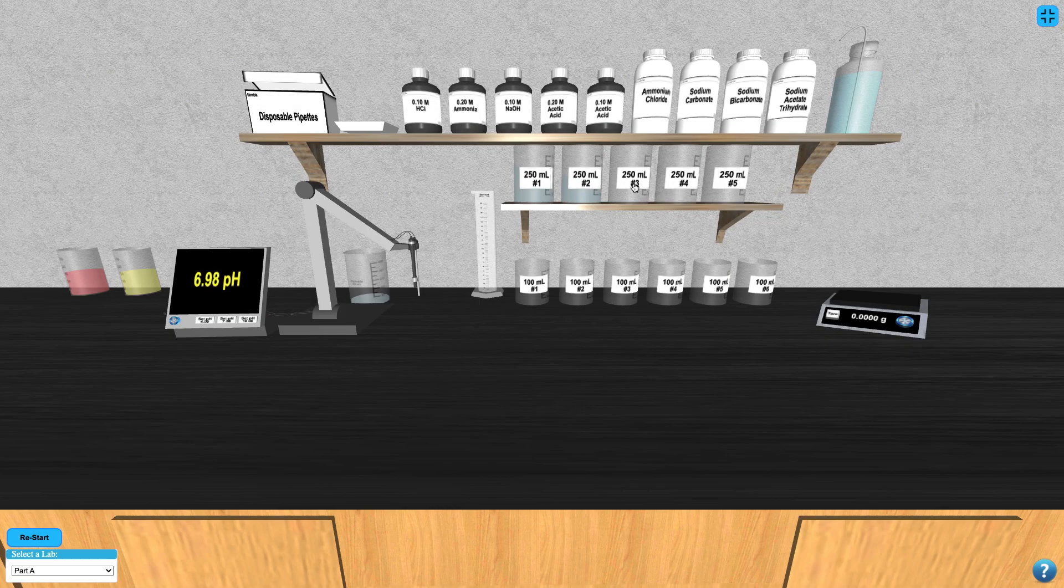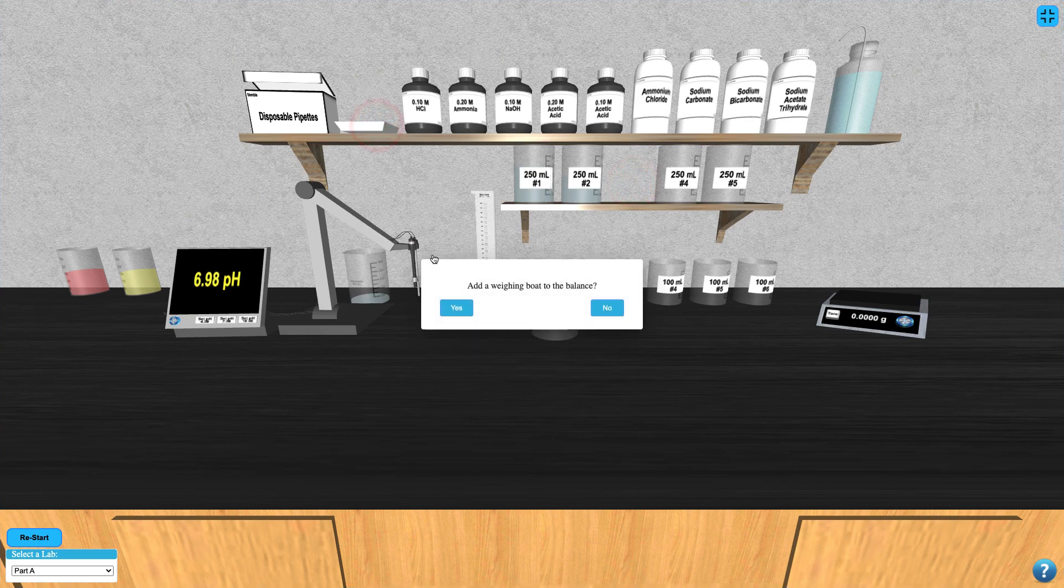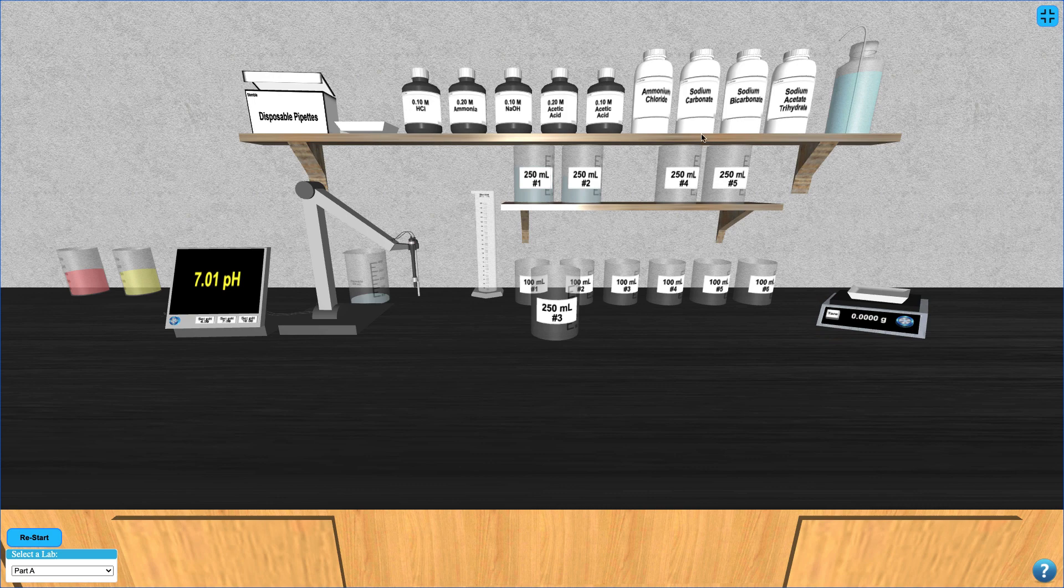Click the beaker of the solution you're making to retrieve it from the shelf. If you need to add one of the solid samples to the beaker, add a weigh boat to the balance and tare the mass of the weigh boat. Then you can click on the sample you need to retrieve it.